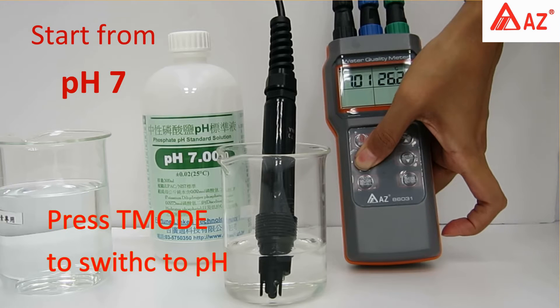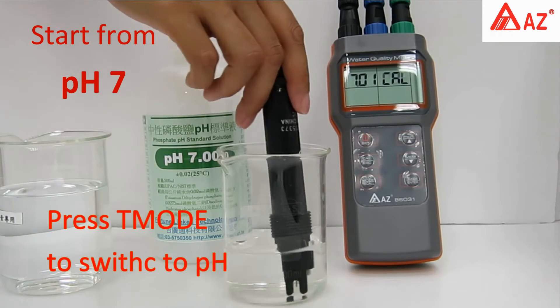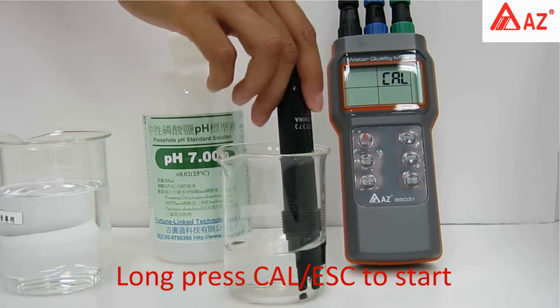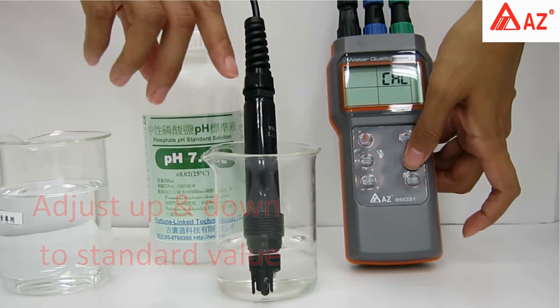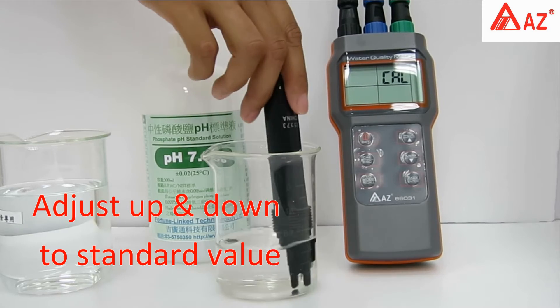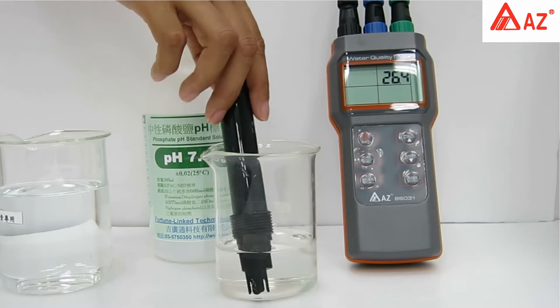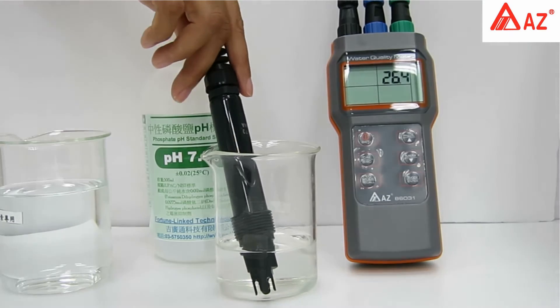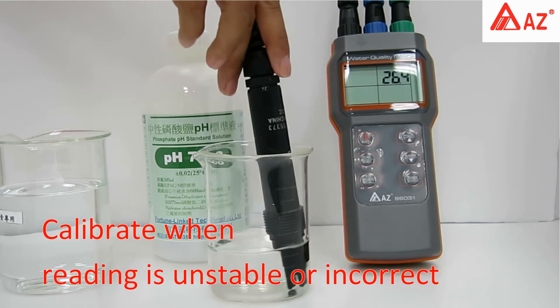For pH calibration, start with pH 7. Press T/Mode to select the probe type, then long press Cal to enter calibration. Set the standard value using the up and down keys. Use a transparent container and make sure the pH electrode is completely immersed in buffer. Stir gently to get a homogeneous condition. Calibrate when the pH reading is unstable or incorrect.